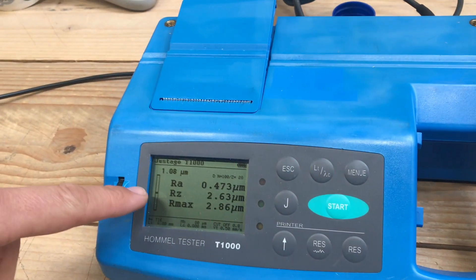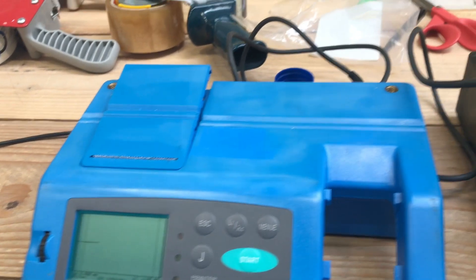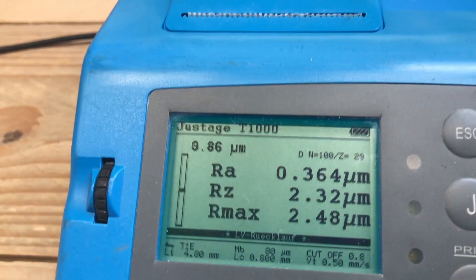We level it down. 1.10 — so completely in the middle. Start: 0.364.